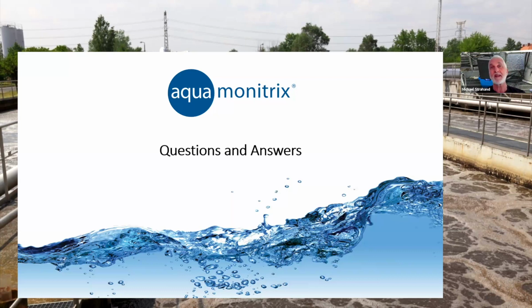So the ability to measure all of the forms of N, with the exception of the organic N. We'll be able to measure ammonia, nitrite, nitrate, which in most cases in final effluent is 95% plus of the N that's around there. So there's an interesting application there from a compliance point of view, as well as process monitoring.